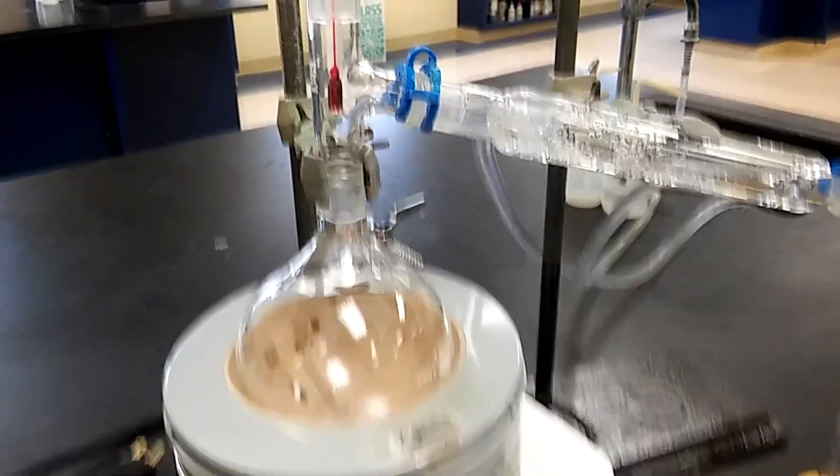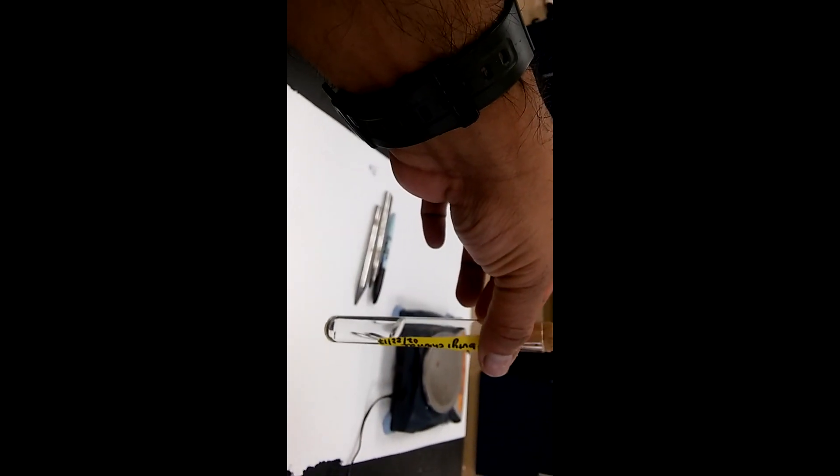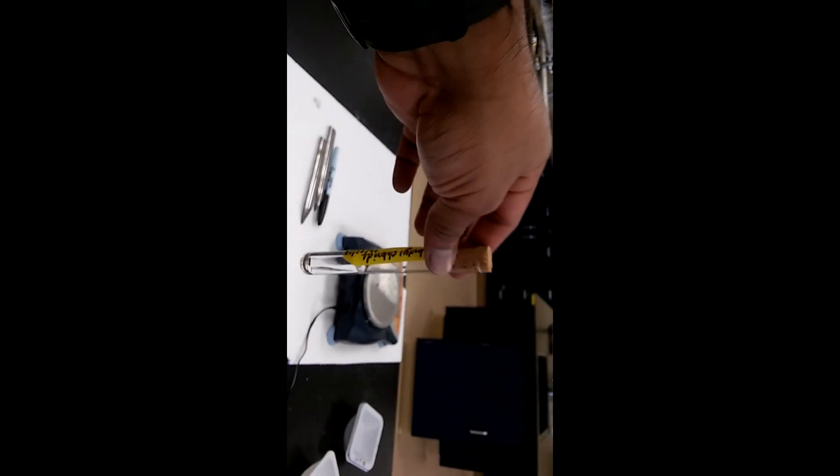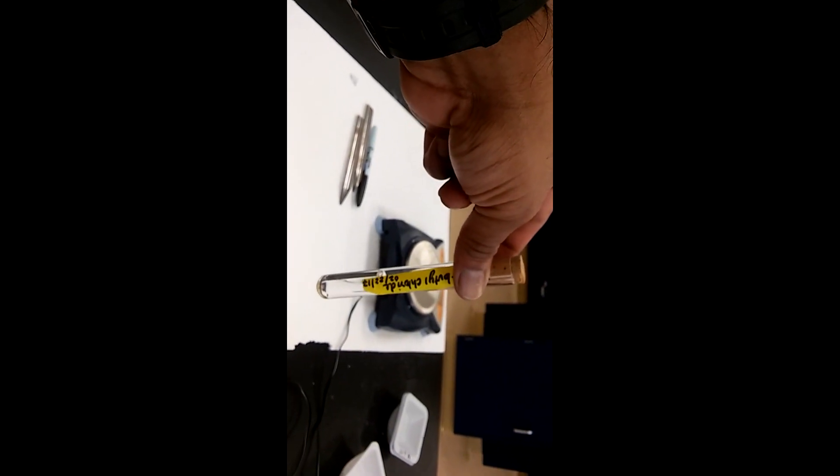Here's the final video in the t-butyl synthesis video series. Here we have our pure t-butyl chloride. If you collect between 49 degrees and 52 degrees, the product you'll have would be your t-butyl chloride. I calculated the percent yield - it came out to be 49%, not bad, not great either.